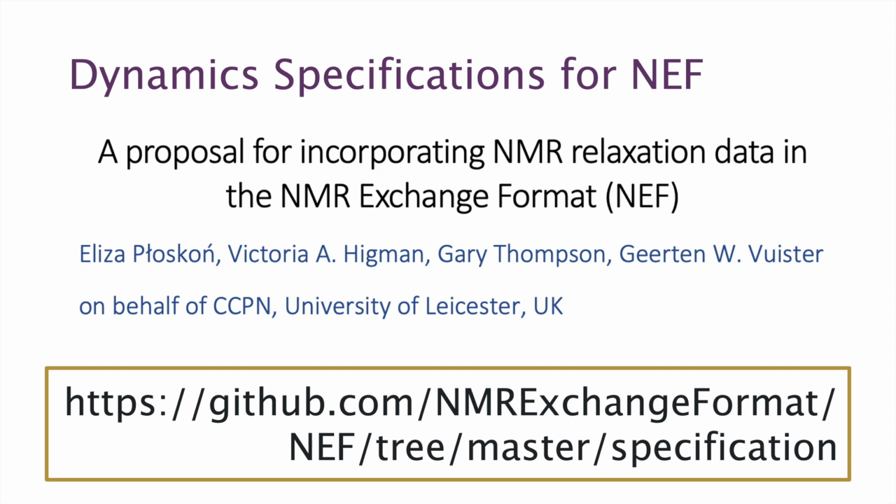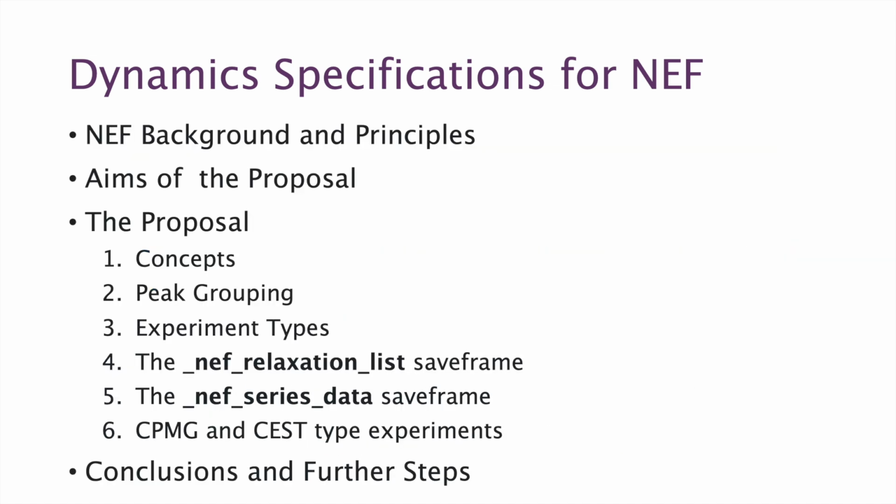The NMR Exchange Format is a community effort, and it is really important that the whole community contributes towards its definition, so as to improve it as much as possible and give it widespread support. This presentation provides an overview and introduction to the document. I will first go through the background and principles underpinning the NMR Exchange Format, briefly mention the reasons for our proposal, before going through each of the 6 parts of the proposal and wrapping up with some comments about next steps.